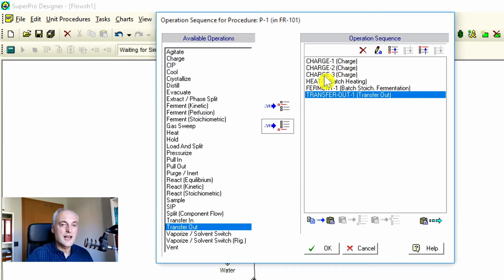We realize that if we bring in the water, it comes in at 15 degrees. It makes no sense to start directly with the reaction. So we need to heat it up. And this takes time. You remember, this is a reactor with 1,500 kilogram water. You need some heating and this costs energy. This is not done in 1 minute. And then, of course, we do the fermentation itself, and we have the transfer out.